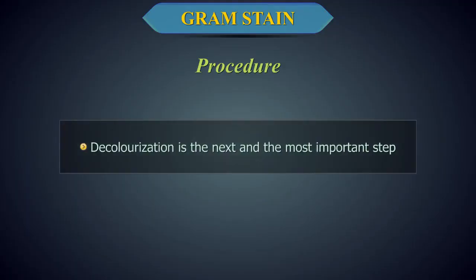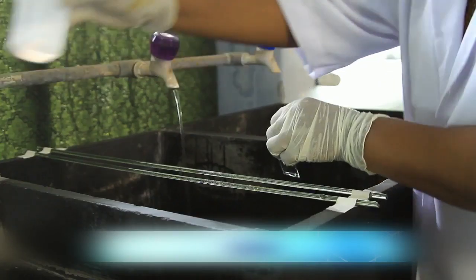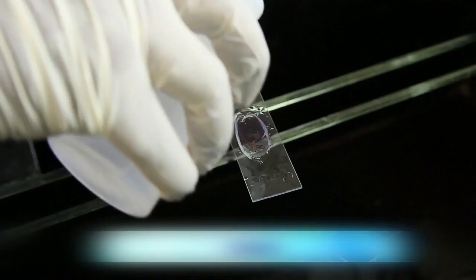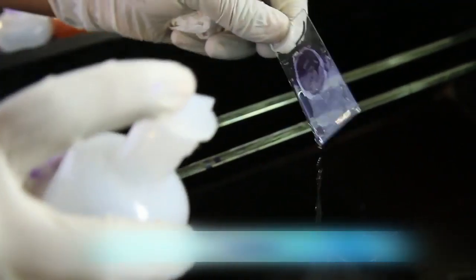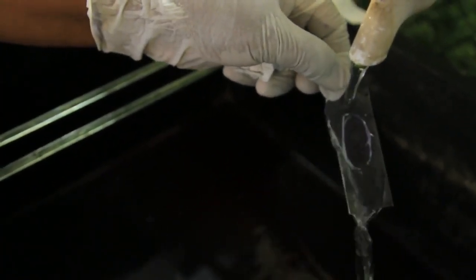Decolorization is the next and the most important step. Decolorize using 95% ethyl alcohol or acetone. Tilt the slide slightly and apply the alcohol drop by drop for 5 to 10 seconds until the alcohol almost runs clear. Immediately rinse with water.